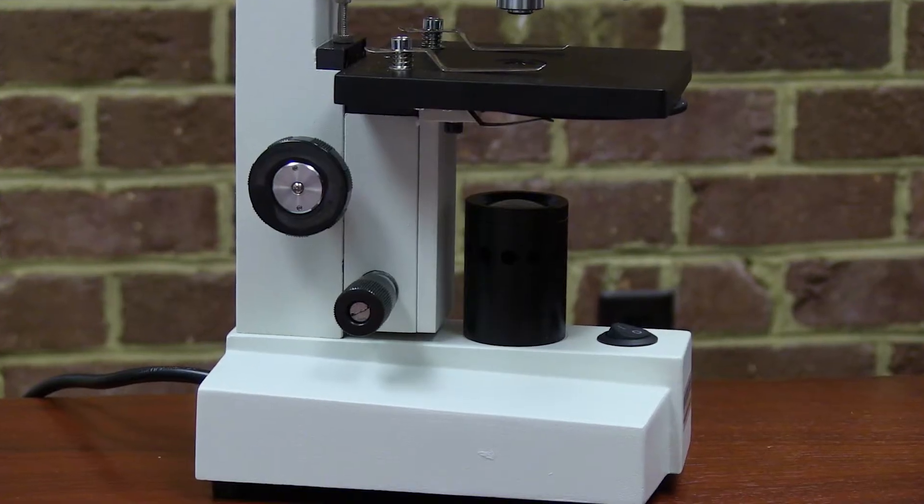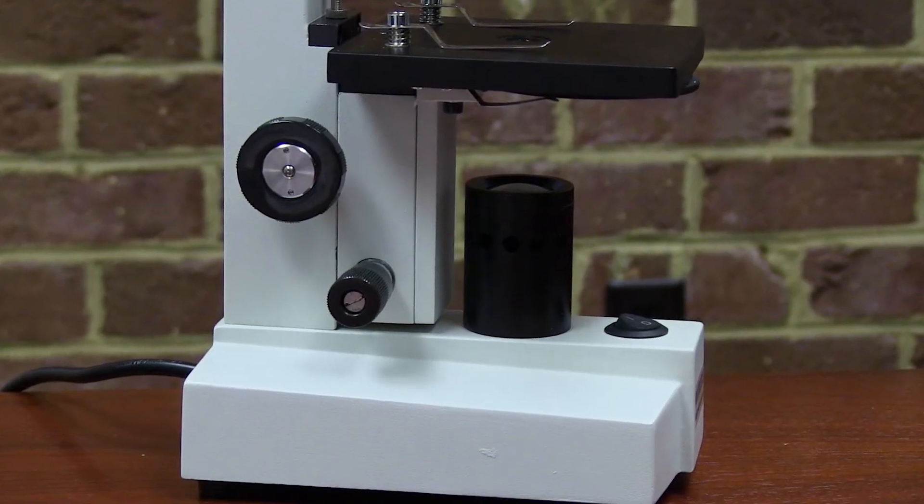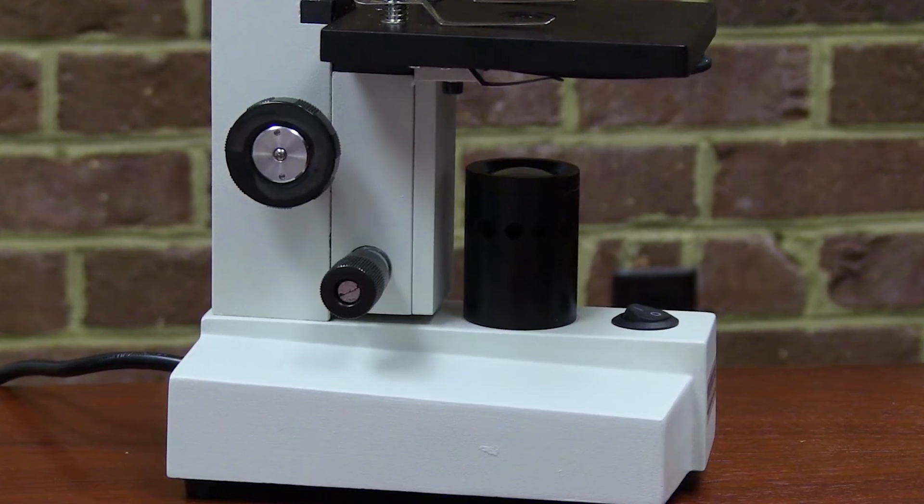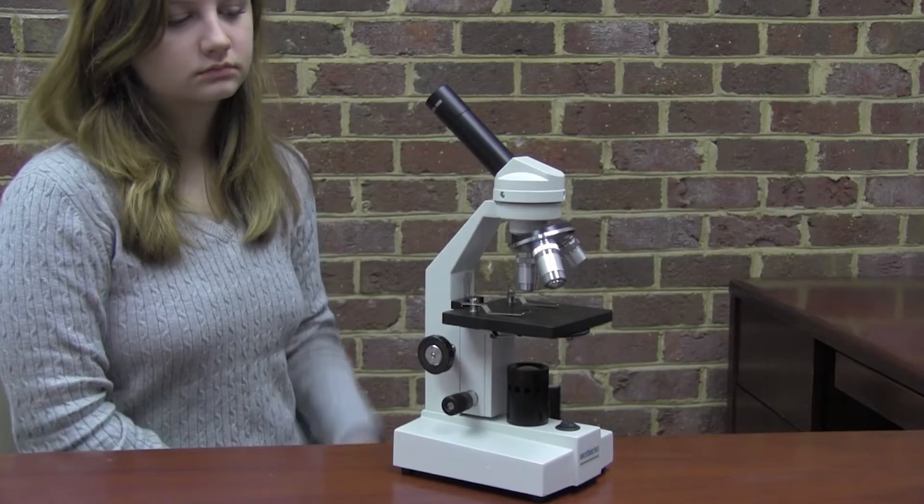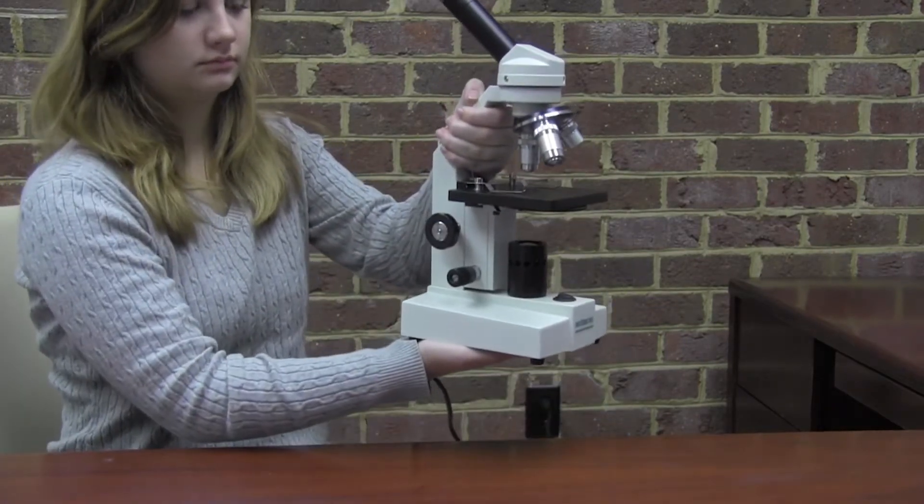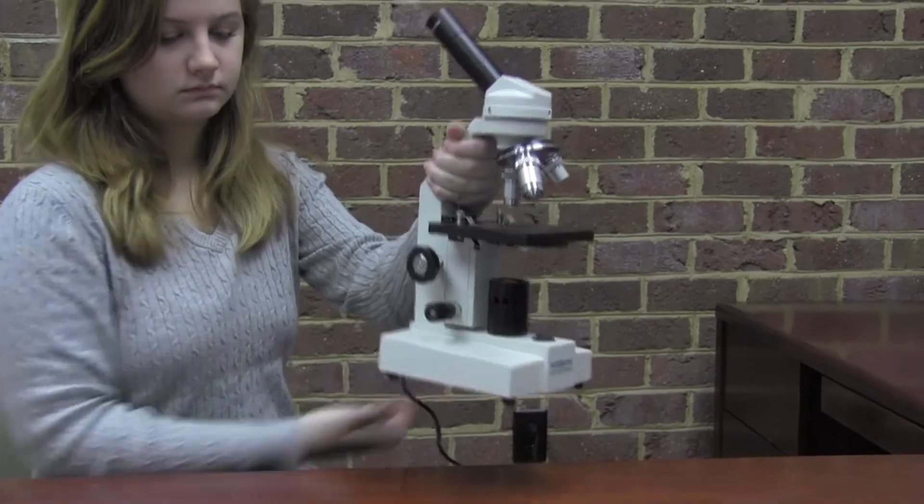The bottom of the microscope is called the base. Always place the microscope base on a firm, steady, flat surface. Whenever the microscope is moved or carried, it should always be held by the arm and the base, like this.